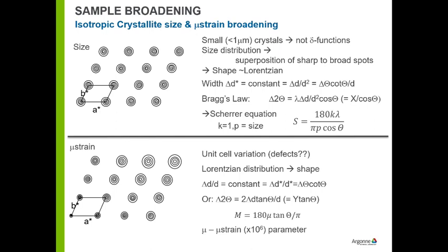On the other hand, if you have microstrain in the lattice, what that means is that not all the unit cells are the same size. And the reason why that happens is because you have defects inside the crystal, whatever they are. There's no identification of what these defects are. You simply have defects that make some unit cells bigger than others, or smaller. Well, usually bigger. Well, what that means is that the variation in unit cells then changes reciprocal space from being a point at the origin to something broad out at larger d stars. And that's simply because the unit cells are a different size.